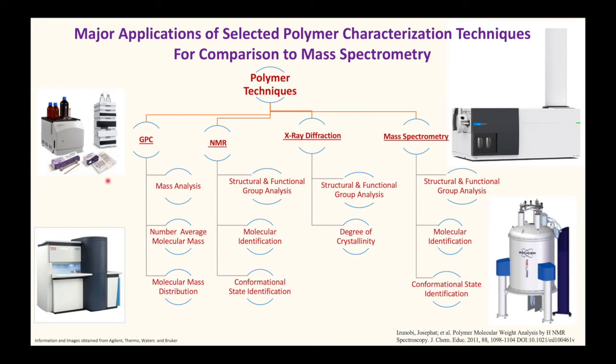The data acquisition process for collecting the data is based on the separation of the polymer's hydrodynamic volume rather than the polymer's actual molecular weight. So the end user is required to convert the raw data into a usable molecular weight scale. This conversion is based on the use of calibrating standards and analyzing the polymer samples under the same operating conditions. This method is based on relative proportionality, which means that this technique is prone to significant errors.